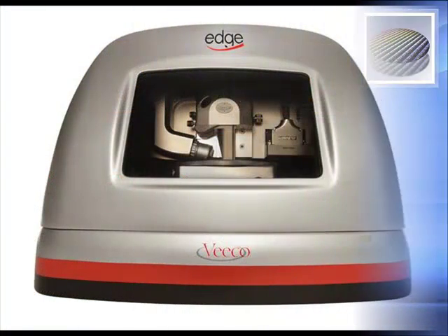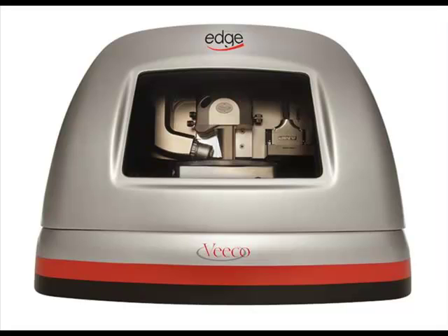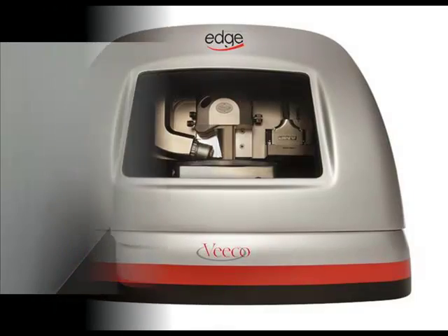The Dimension Edge is a tip scanning instrument that utilizes the same scanner used on the Dimension Icon, and has a programmable stage with a 150mm by 150mm inspectable area.